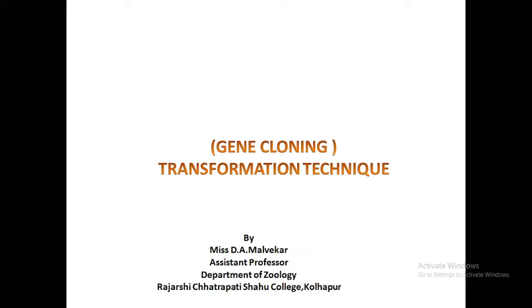In the last lecture, we discussed one method of gene transfer, that is the calcium chloride method, which was very easy and can be used for bacterial cells, but it has certain limitations: it cannot be used for all types of cells. So here we are going to discuss another transformation technique, that is electroporation.